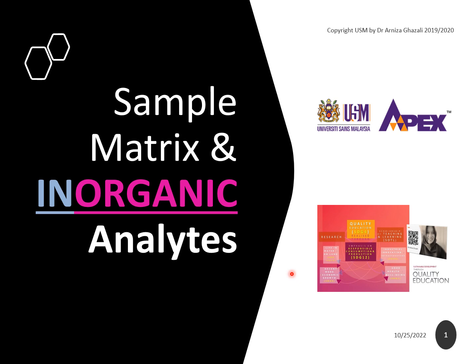So inorganic analytes refers to the inorganic elements in the periodic table. And today we are going to look at sample preparation involved in a biosynthetic sample requiring you to extract out the inorganic analyte.